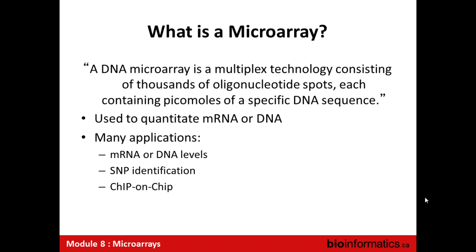So here's a kind of good definition of a microarray. I say kind of good. This is the Wikipedia definition. It's a multiplex technology consisting of thousands of oligonucleotide spots, each containing picomoles of a specific DNA sequence. It's not actually a bad definition. It's a little bland, but I think the key point there is that it's multiplex. A microarray is a way of measuring a lot of things in parallel.